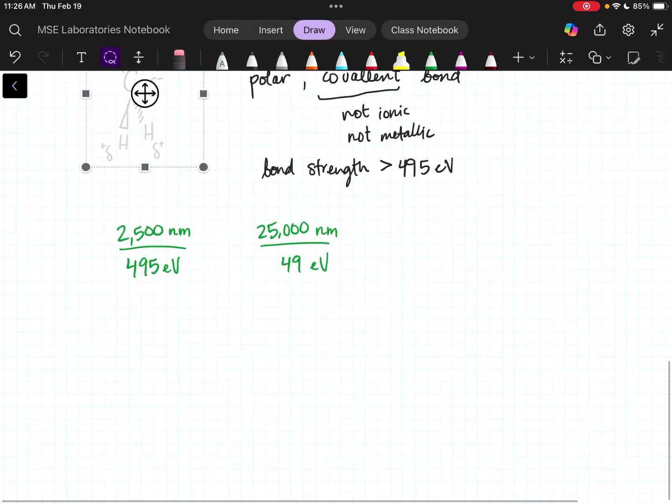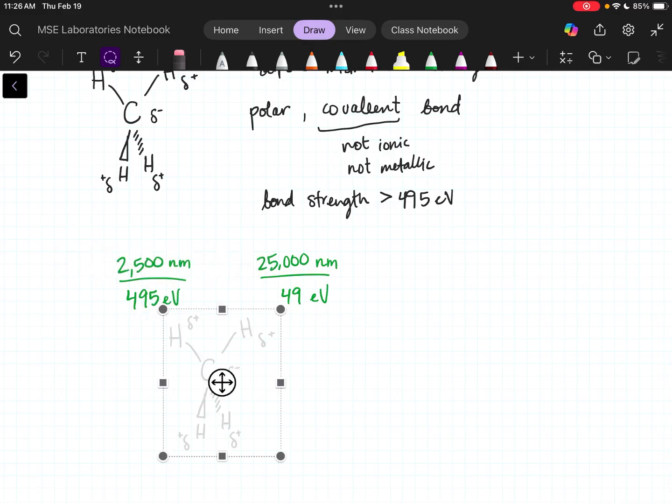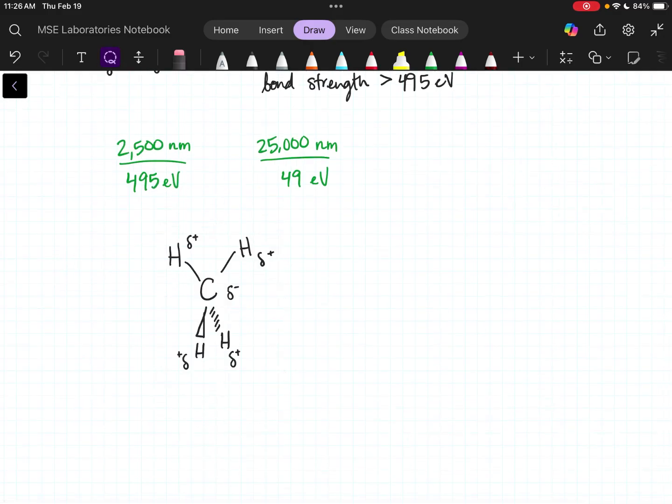equivalent to, there's like a thing on the screen, because they're not going to break it, what actually happens is instead I get bending and I get twisting. So I can get these hydrogens twisting around the center carbon. These bonds also can stretch back and forth, kind of like get longer and shorter. Or instead of twisting, they can push apart from each other or toward each other.